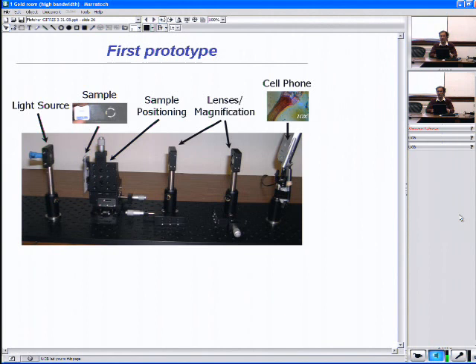So this is more of an expanded layout of a traditional microscope, and that traditional microscope is quite large because there's really not a motivation to keep it too compact. We wanted to initially see, could we do this sort of imaging with a simple layout of lenses? One of the tricks that I should point out is that with this sort of layout, what we really want is a bare CCD at the end of this optical train. We don't want another set of lenses there.